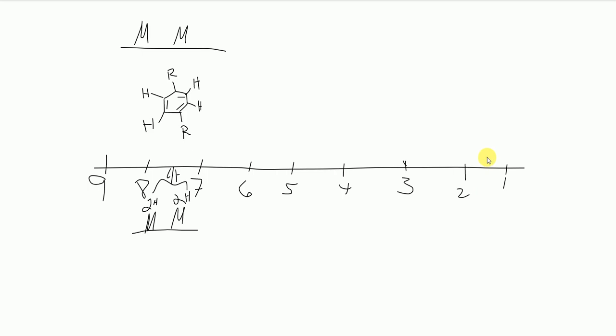Now, everything in like the 1 to 3 region is going to correspond to just basic carbon hydrogen bonds. So you'll have a lot of different peaks over here. And there's something unique that happens, and we call this downshielding or downfielding, deshielding. When these peaks are stretched to the 4 region, so like the 3.5 to the 4-ish region and above, this means that these carbon hydrogen groups are adjacent to something that's very electronegative. So it's usually an oxygen for your case, so an alcohol in particular, or an OR group, or a halogen.